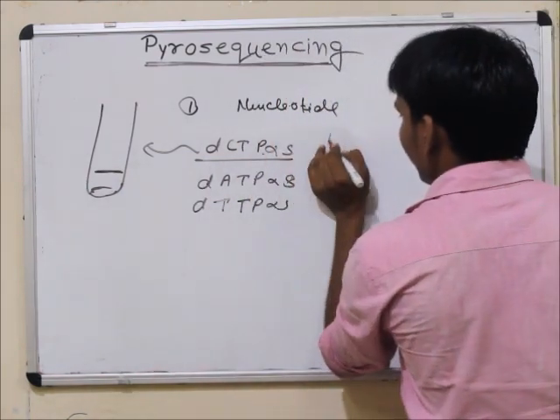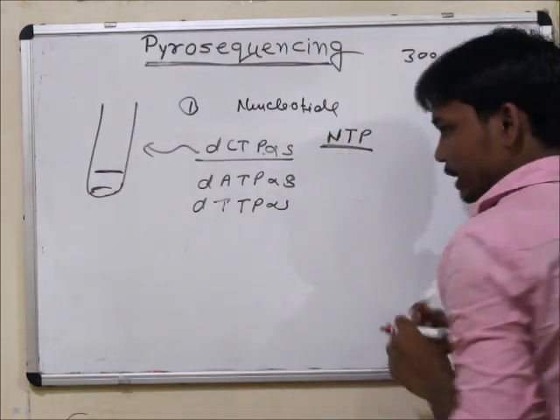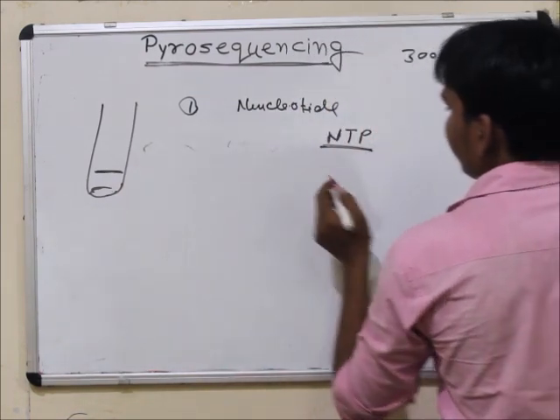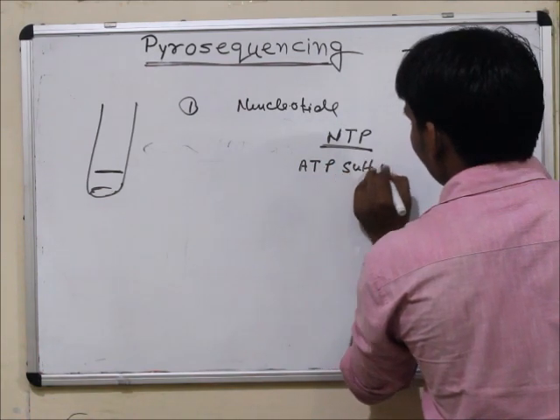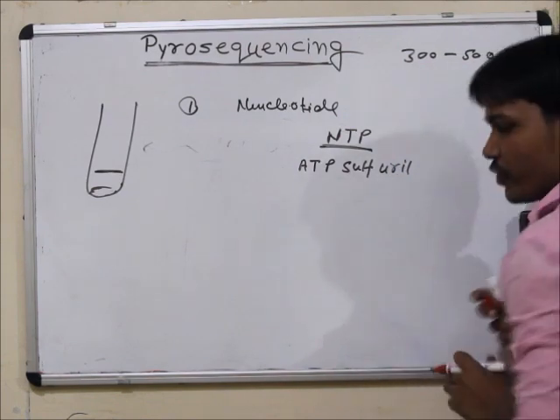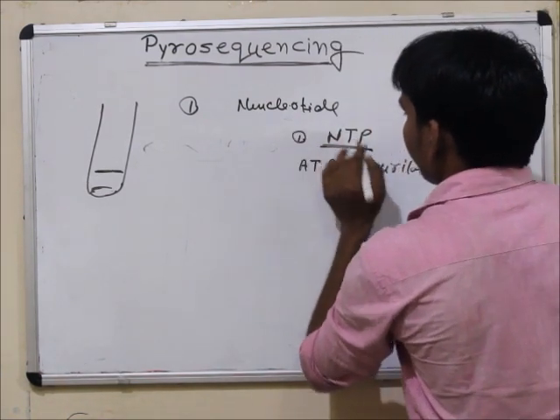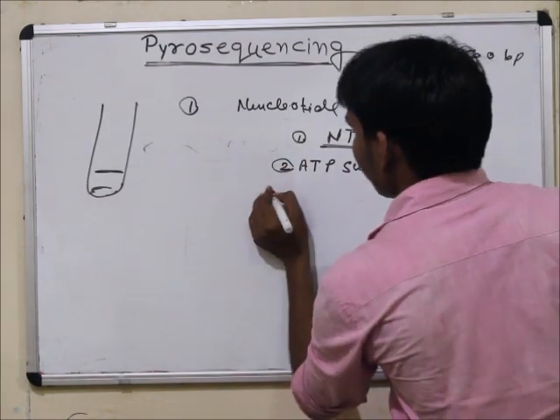First is the nucleotide triphosphate that is added. Second is ATP sulfurylase.